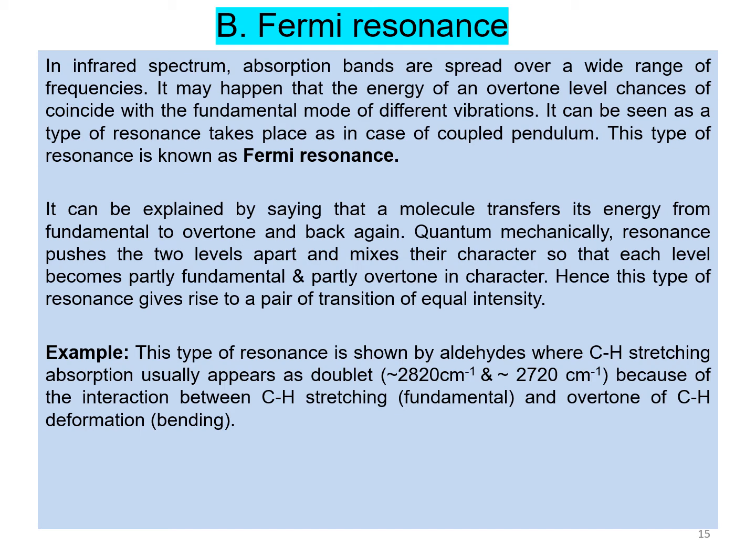For example, in the case of the aldehyde group, the CH stretching absorption usually appears as a doublet around 2820 and 2720 because of the interaction between the CH stretching fundamental and the overtone of the CH deformation, the bending.